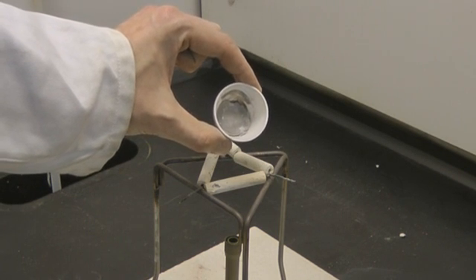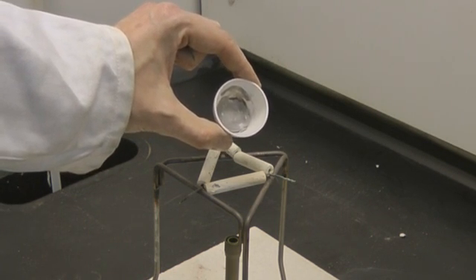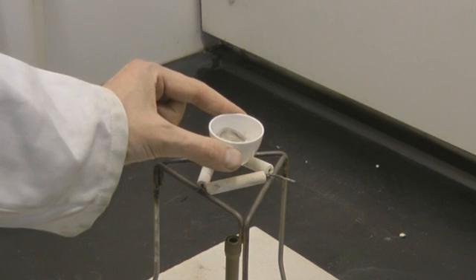After the crucible is cooled, we can remove the lead bromide and we can see the lead clearly visible in the bottom of the crucible.